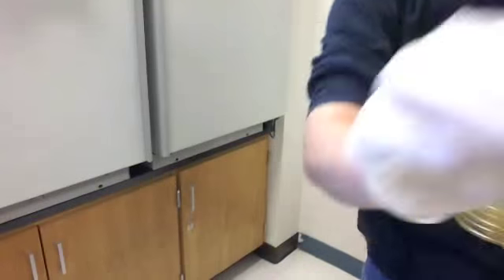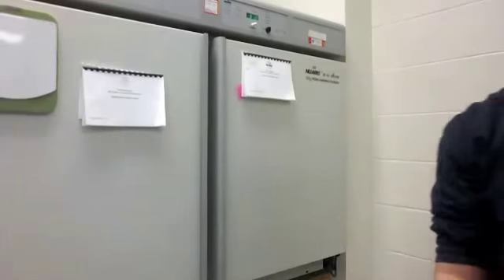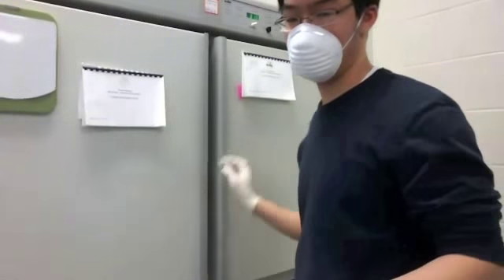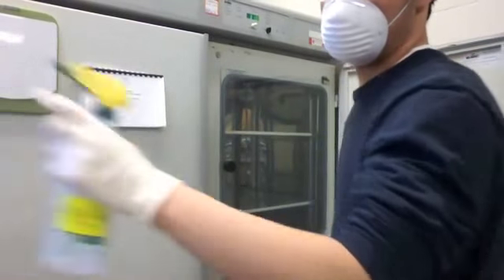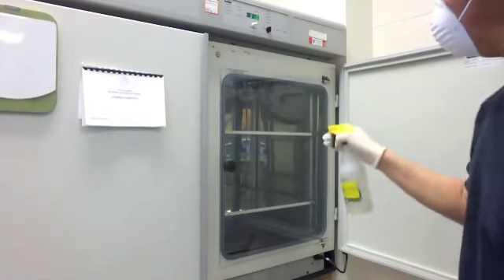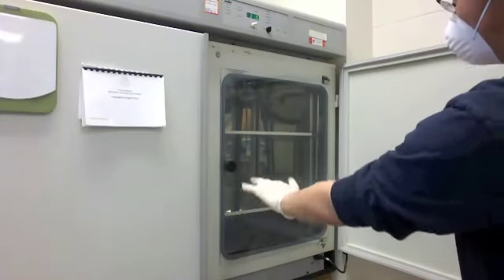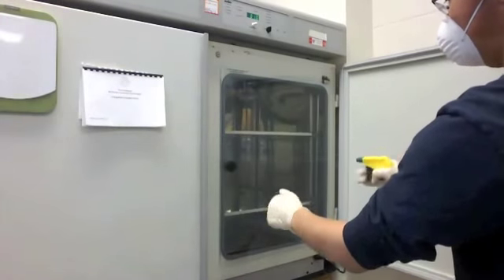Excuse me while I turn the camera a little bit and focus it to point at the incubator. Even though this is more of an open-air situation, I still have to be cautious. I'm spraying the seal around the glass door and the inside with ethyl alcohol, as well as the handle and my arms, since they've been exposed to the air — trying to kill off as much bacteria as I possibly can.